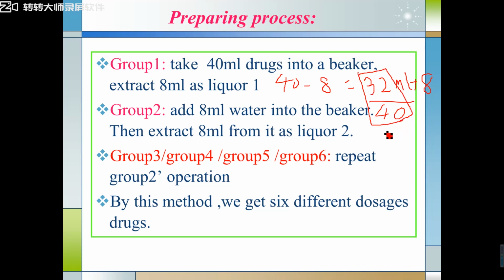That means we dilute the drugs at the ratio of 0.8.